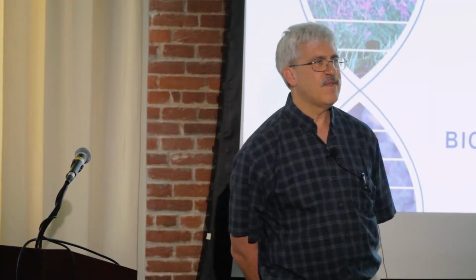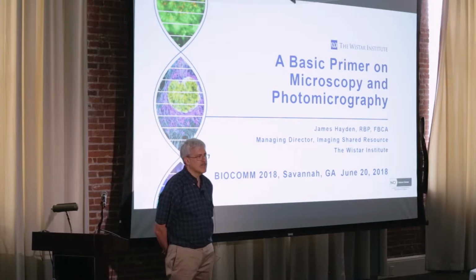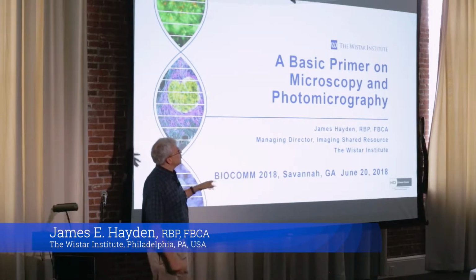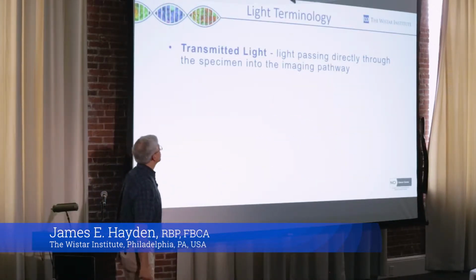This is going to be tough for me because I am taking what is normally 4 hours worth of material and shoving it down to 45 minutes. I'm giving you sort of the basic primer on microscopy and photomicrography, which is taking pictures through the microscope.